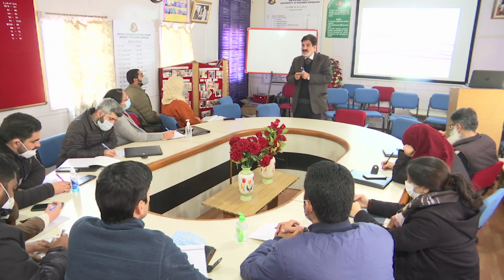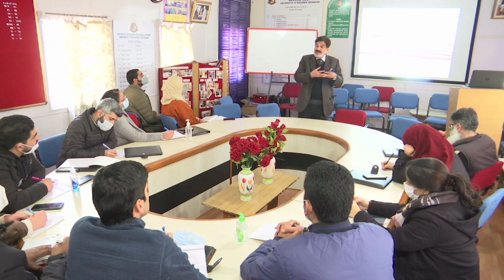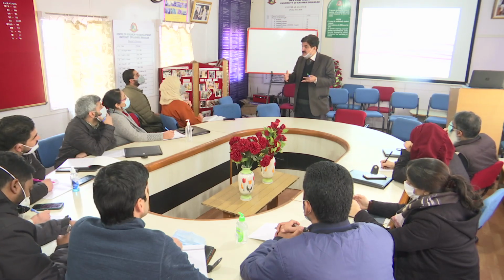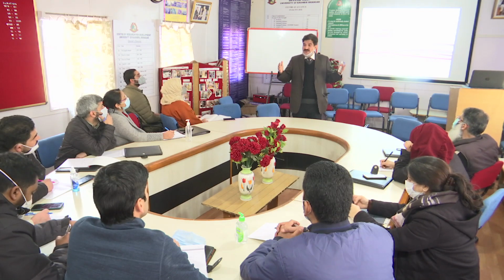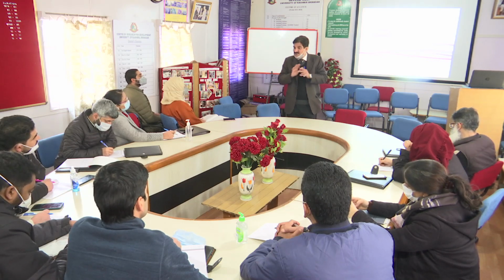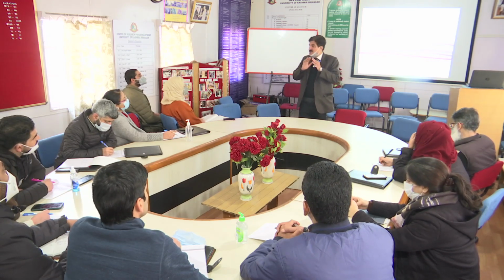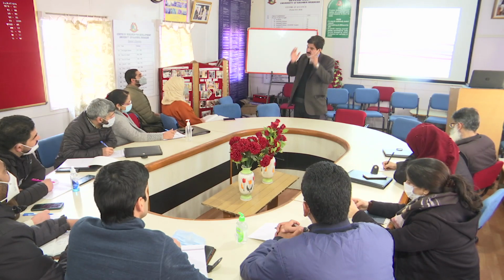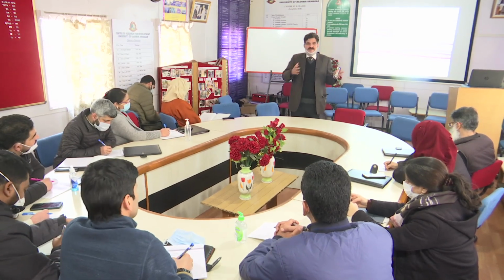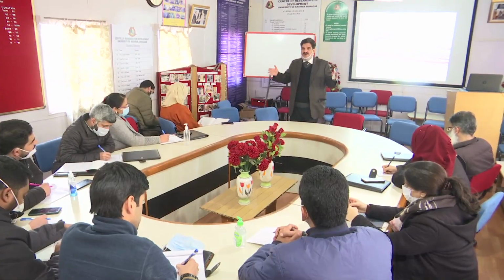Not only this, you have a buffer system, because the buffer should be of such pH and concentration where your DNA molecule, the molecule of choice I can say, is stable. You have to keep that in a stable position. Only for that very purpose you require a buffer of proper pH. Usually Tris buffer is preferred in this case, because its pK lies within the range of 8, so that we can achieve pH 7 to 8.